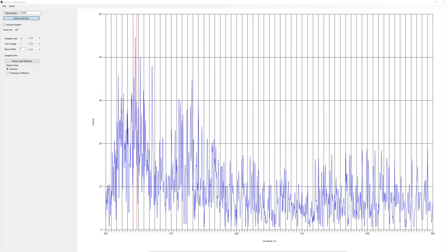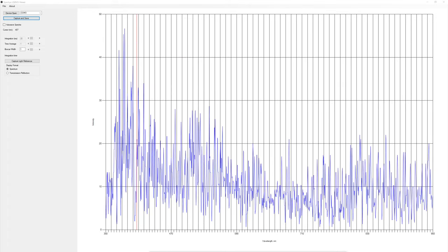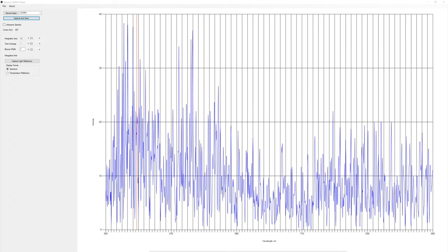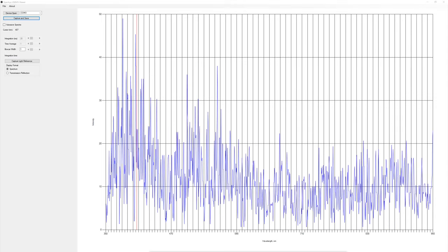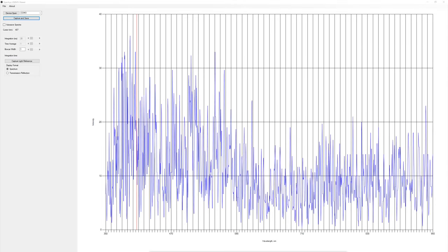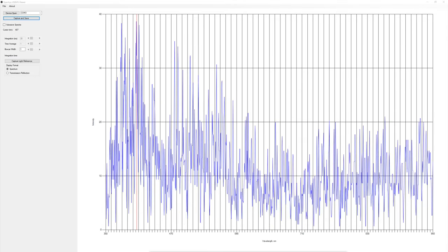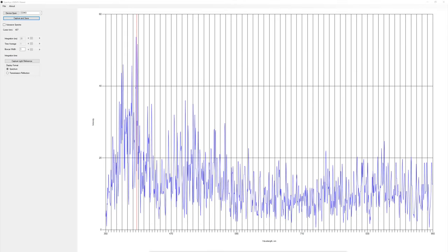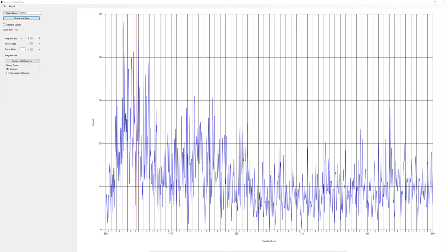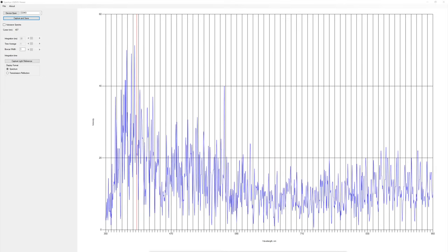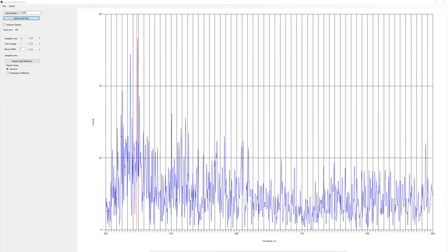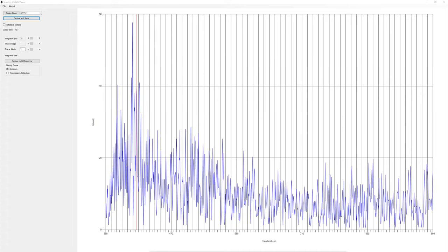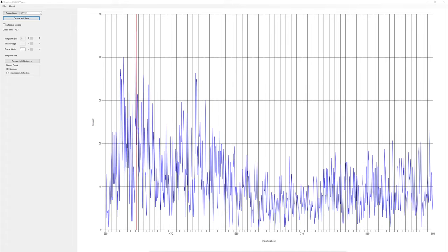I have the lamp, the Helios, in the other room, and it is in a darkened room with the Spectrix spectrometer. What you are looking at here is the noise, and hopefully I can just plug it in over here, and we will get a spectrum coming out of that.